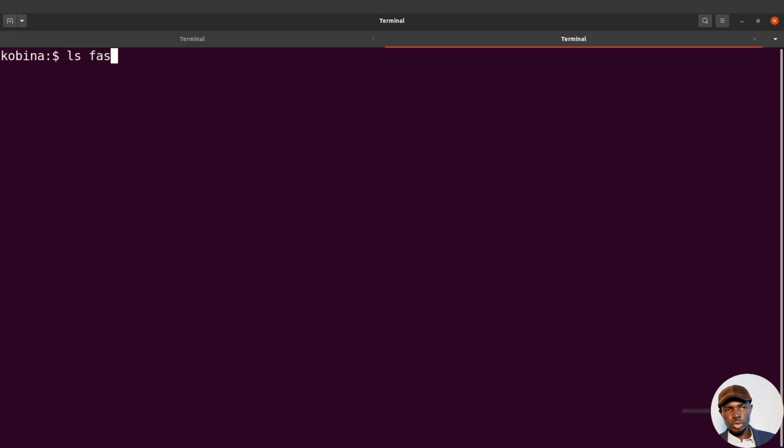Let's do an ls into our fastq directory again. We have our files. Now, with the output, what we want is to supply the sample name minus the .fastq.gz and this _1 here. So _1, _2 are used to differentiate between the forward and the reverse. But we want to create a directory called this, and then everything here is omitted.